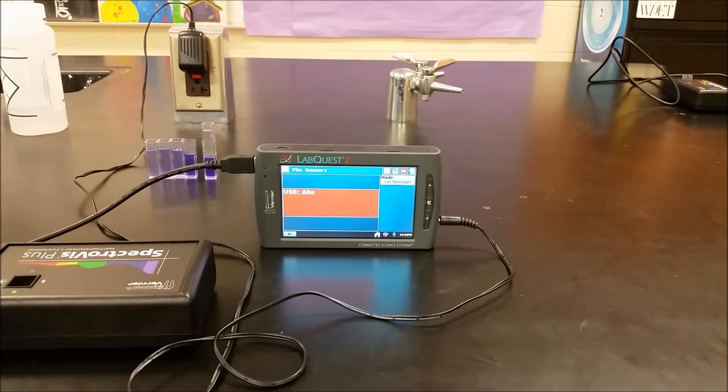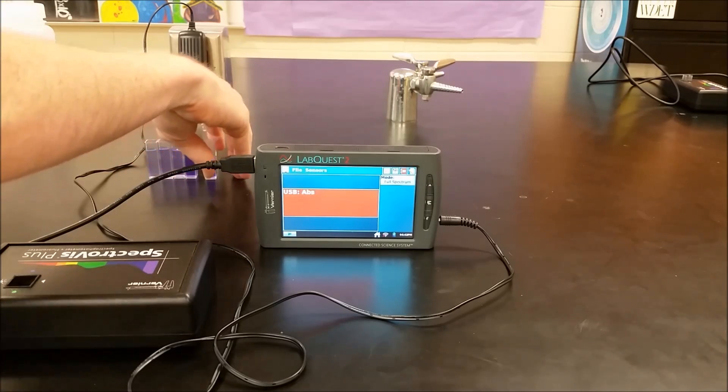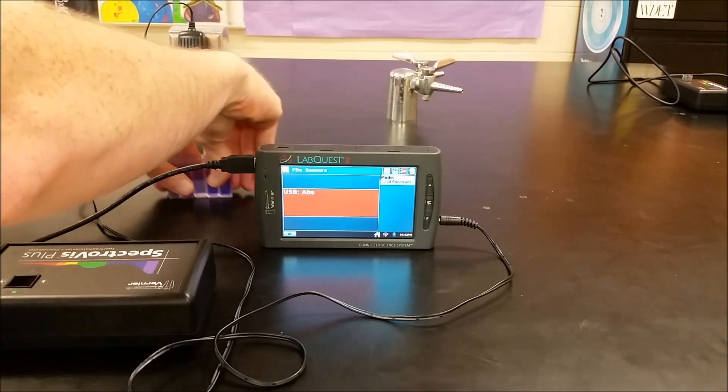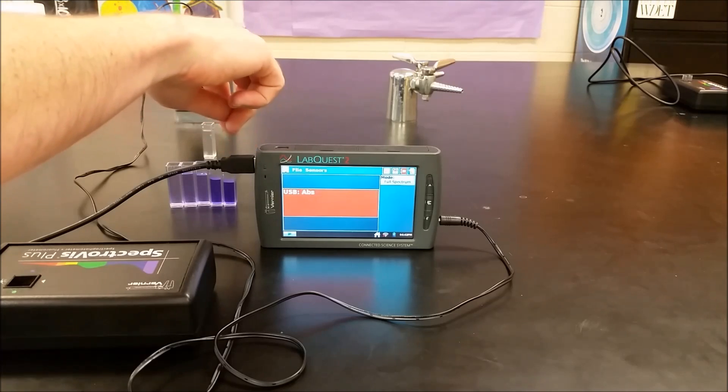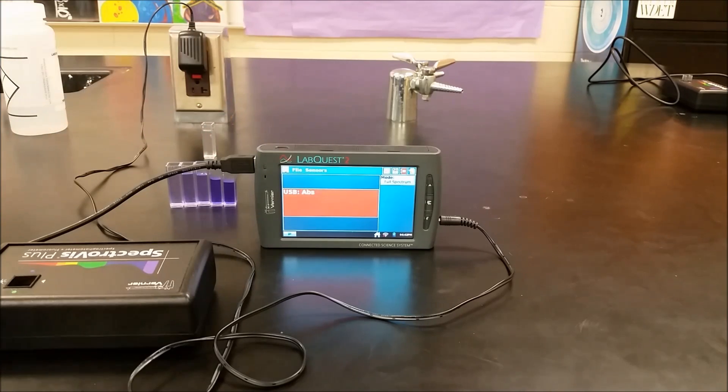Before we start our experiment with kinetics, we're going to first construct a Beer's Law calibration curve for crystal violet. So I've prepared some standard solutions over here. We go from 25 micromolar to 20, 15, 10, and 5.